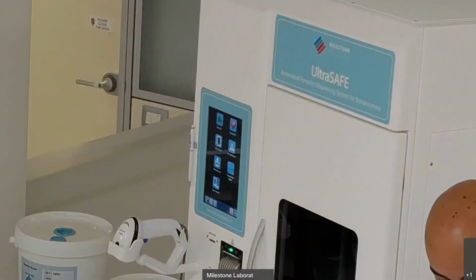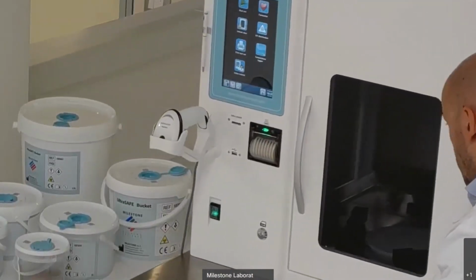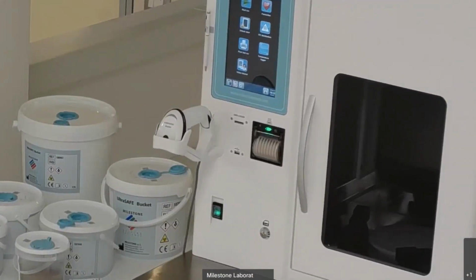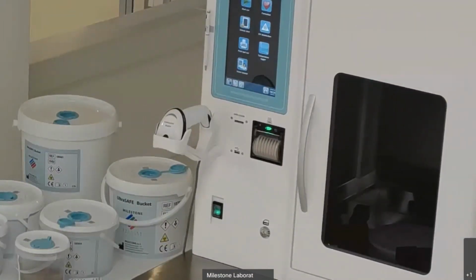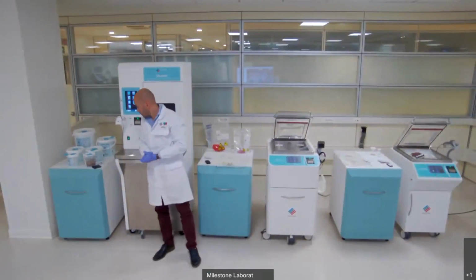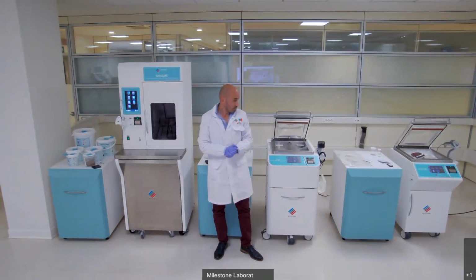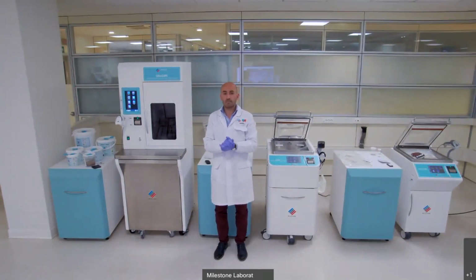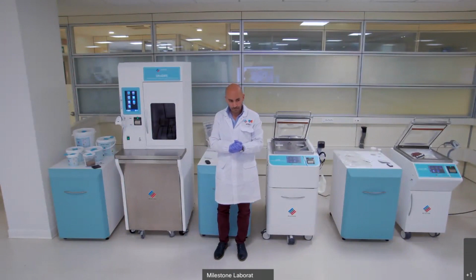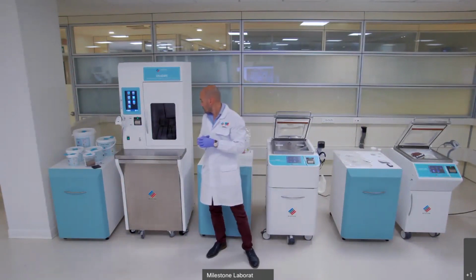Thank you, Marco. Now we'll switch to the other Marco for other questions. So Marco, can Milestone units be connected to the LIS? Yes, as mentioned before by my colleague Marco, the system generates data and collects data. I saw also another question asking if we can add information or change information that is printed on the label. Yes, I will answer right now to that question, saying yes.